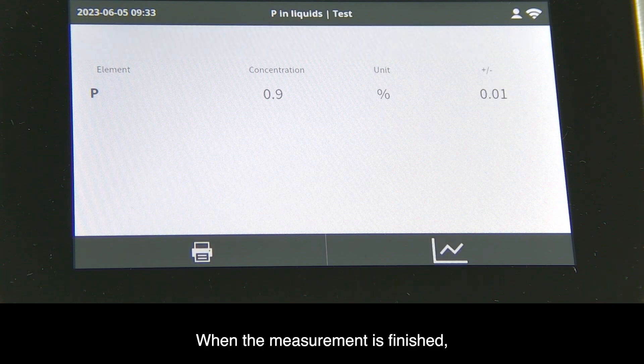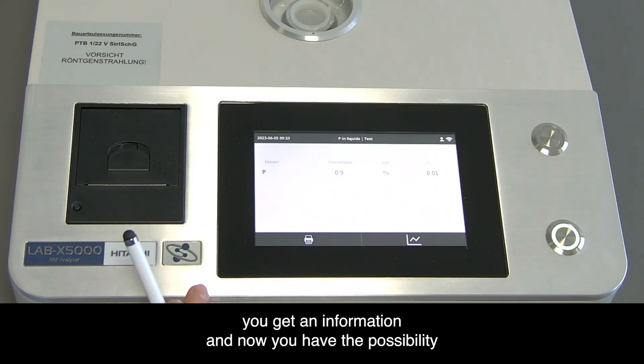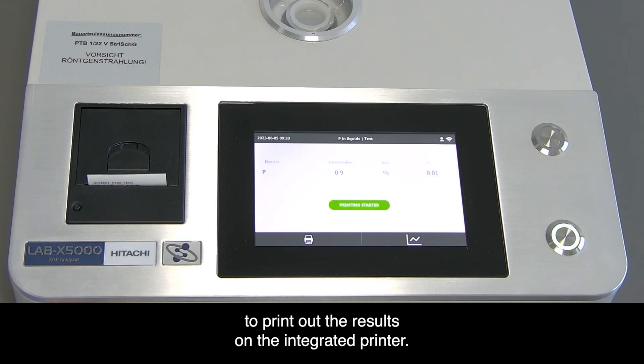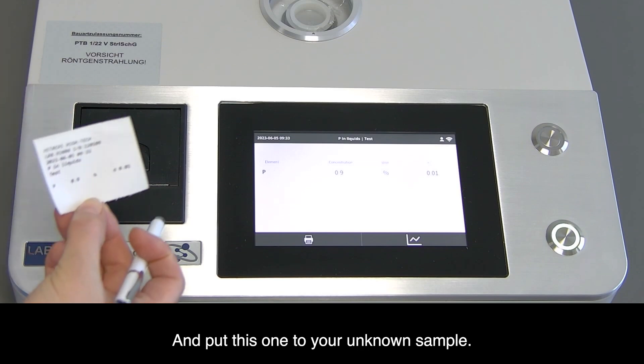When the measurement is finished, you get an information. Now you have the possibility to print out the results on the integrated printer and put this with your unknown sample.